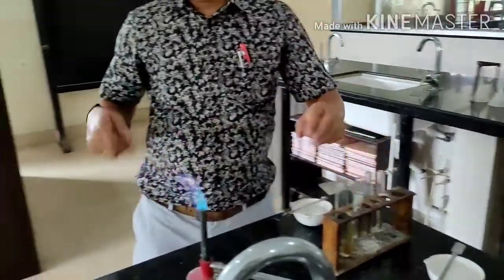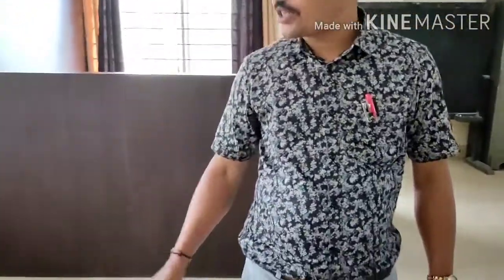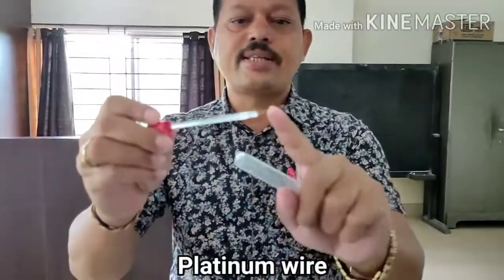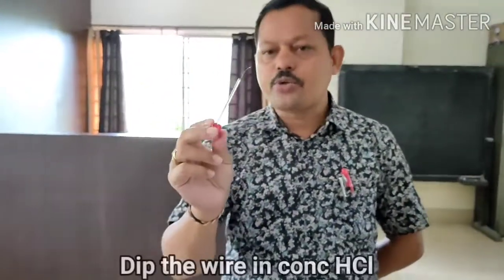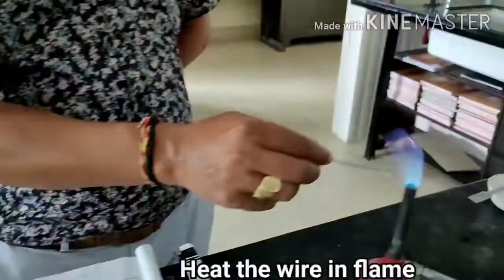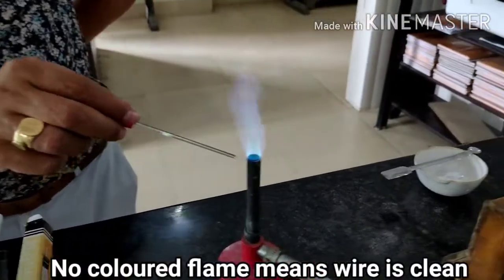Now I move to the second experiment: the flame test. To do the flame test, you have to use one platinum wire. This wire is called platinum wire and it is sealed with a glass tube. First, you take the platinum wire to do the flame test, and the platinum wire should be clean. To check whether it is clean or not, just dip the wire in concentrated HCl. Then you heat it in the flame — there should not be any color in the flame, which means the wire is clean.